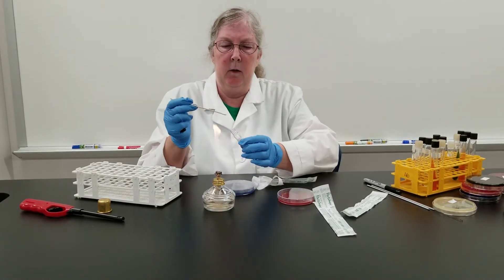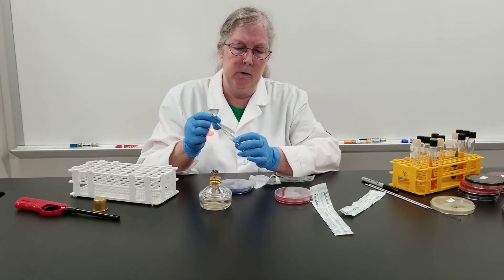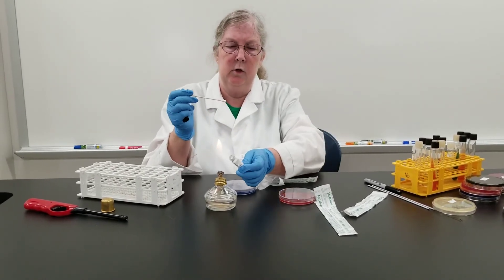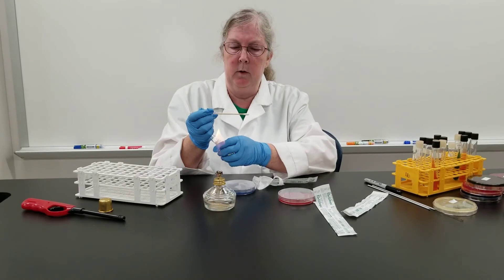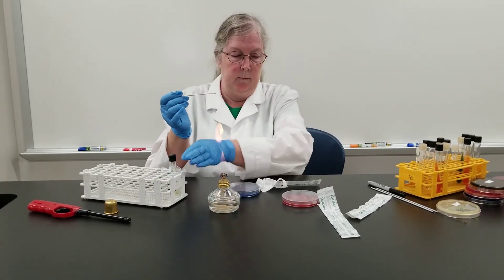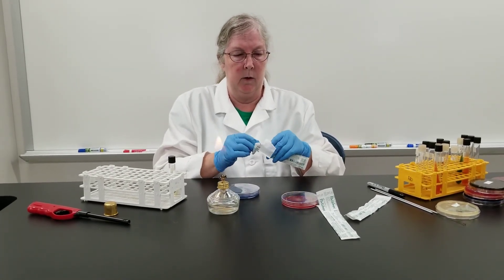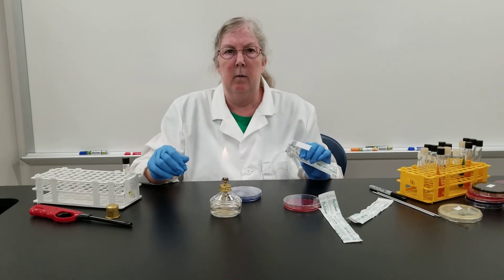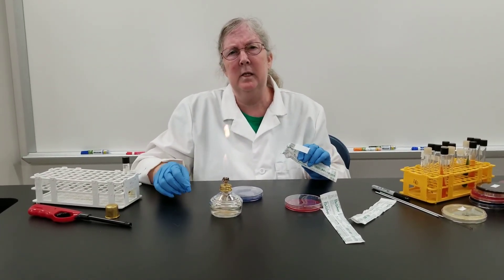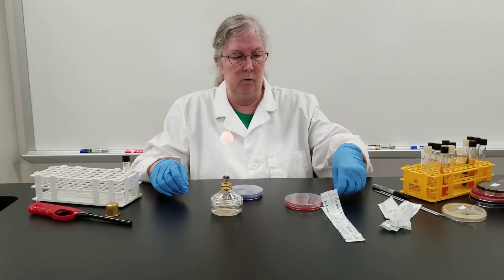These will be incubated in a candle jar because streptococcus prefers a much lower oxygen concentration than atmospheric air. So we're going to put it into what we refer to as a candle jar for incubation. If you tried to incubate it in a regular incubator without any additional supplement, it may grow, but on the petri dish it's going to be really, really tiny. So to try to encourage the growth, we will put it in the candle jar.